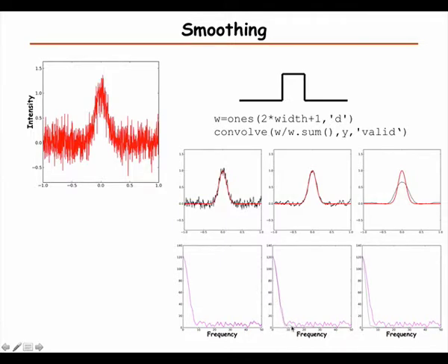But in this case, the gray will start deviating quite a lot above 10, and then it's almost 0, but not completely 0. Then again, if we choose the width too large, our main peak widens. We do remove the noise very well, but our peak becomes too wide. So again, the choice should probably be somewhere in between these two.